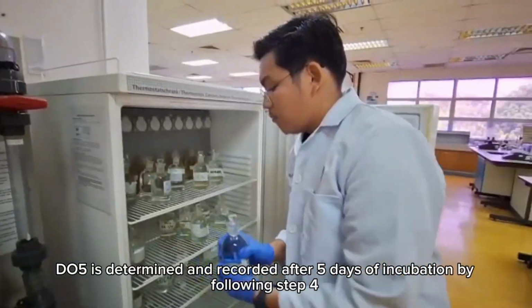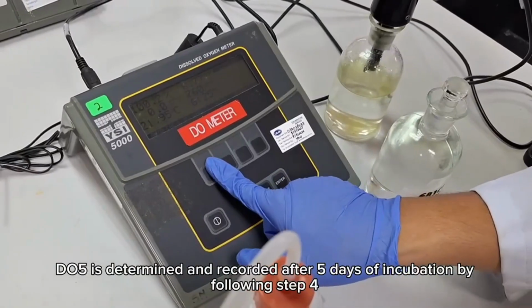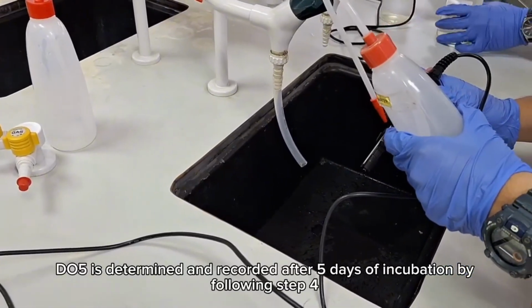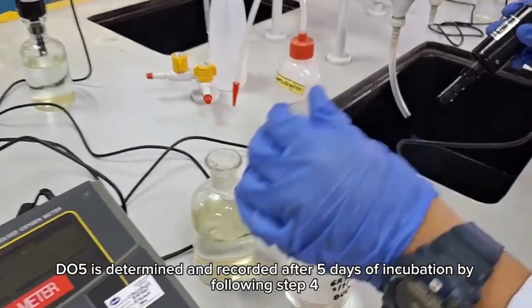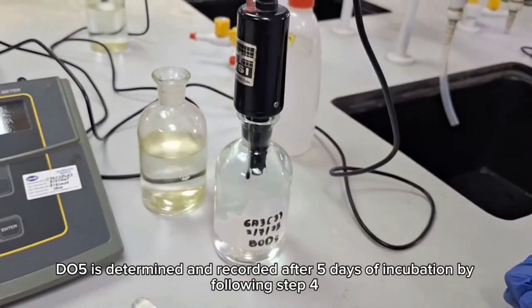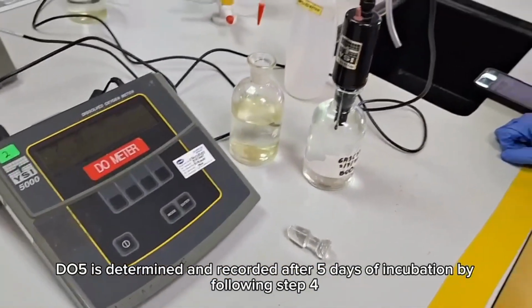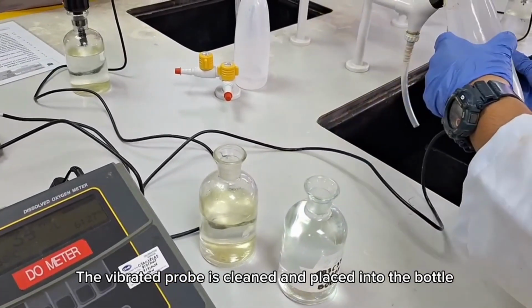DO5 is determined and recorded after 5 days of incubation by following step 4. The probe is cleaned and placed into the bottle.